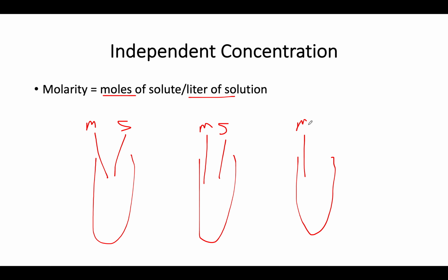So you can see you can make the same concentrations. You're just doing it in a different way. So this is independent, and the previous one was serial.